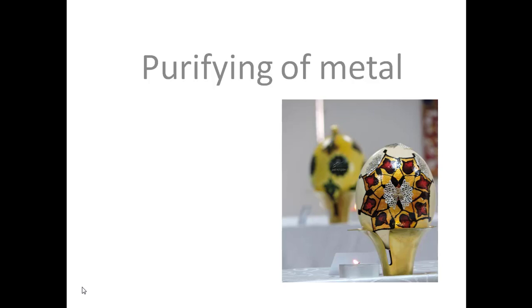If we go to the nature, you're gonna find a lot of stones that consist of copper, gold, silver, a lot of elements. So how to purify them and how to take the metal that we need? So the process is electrolysis. So we start with purifying of copper.